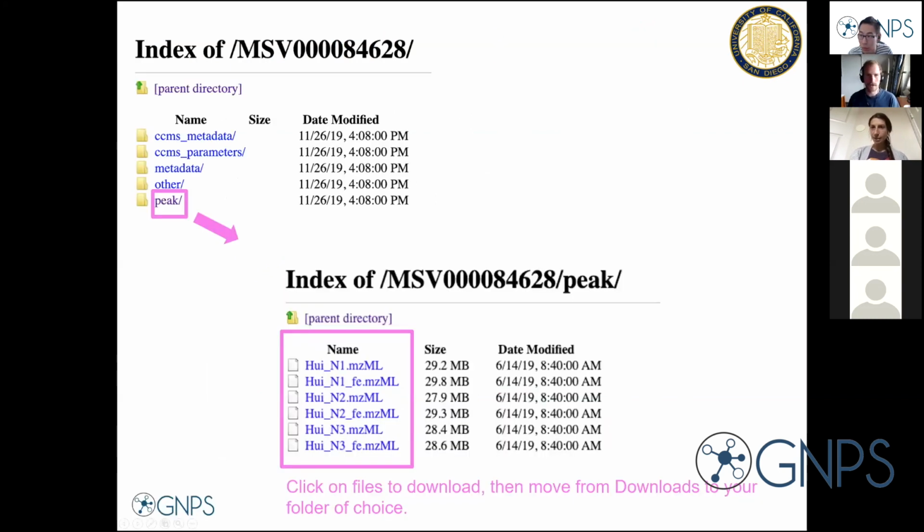Sounds good. It seems like many people have it, so that's working. I think that was actually one of the biggest challenges of the workshop, to download it. And then the second one we will face in a second is that everybody has MZmine running.